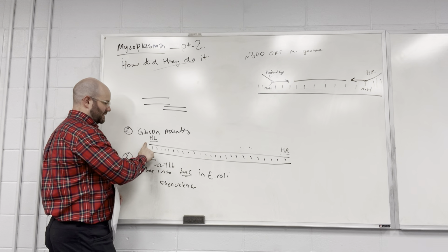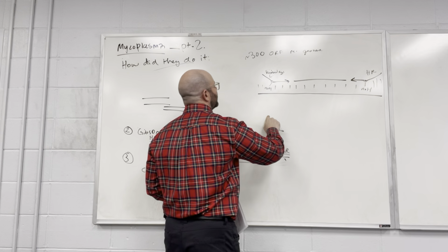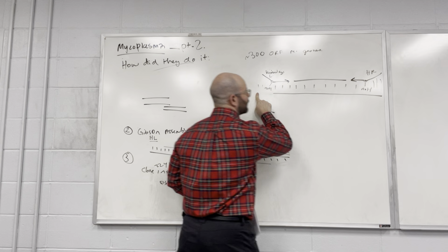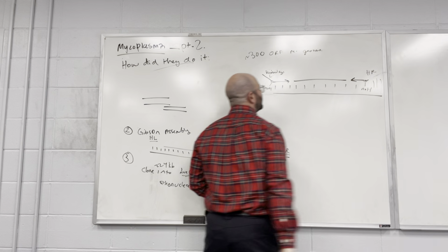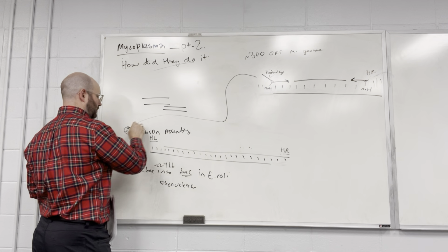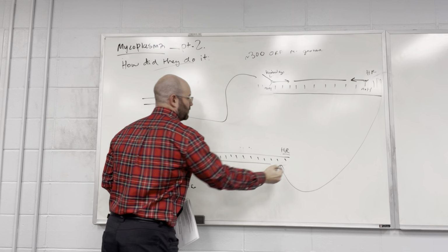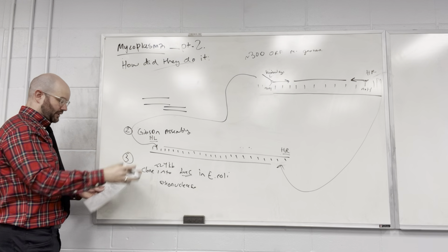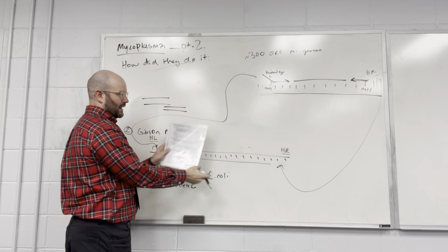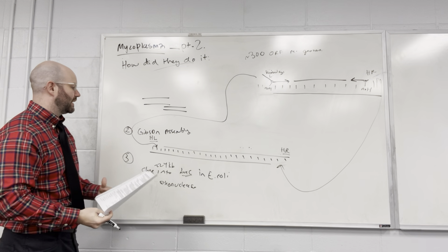Okay, the exonuclease is now going to chew in, and it'll, I don't know exactly, something like that, chew in. And now this can match that, and this can match that, and then it circularizes. So that's what the little drawing here in C is, this process circularizing. That's how they get it circularized.